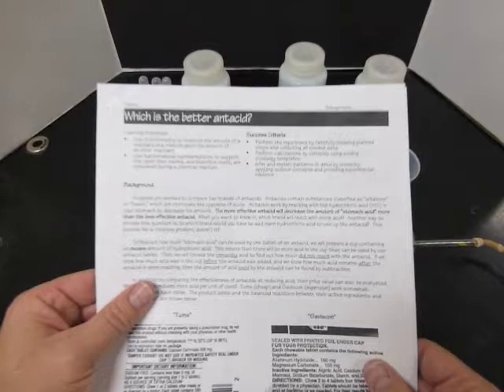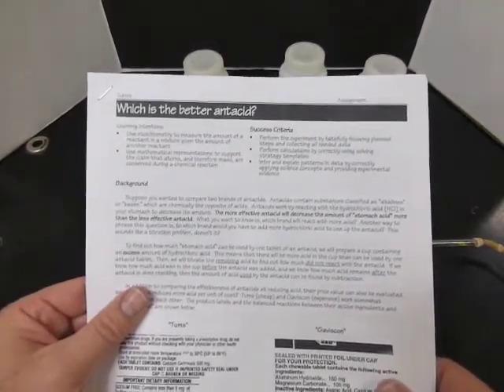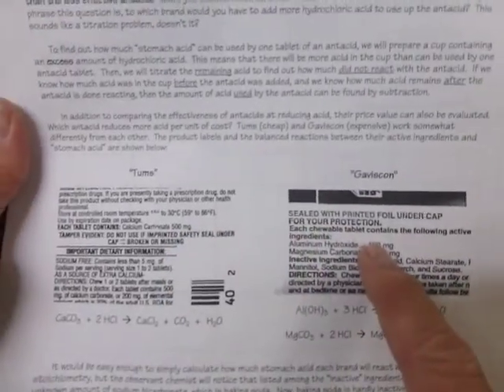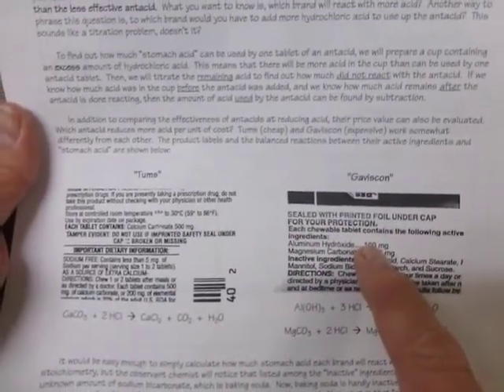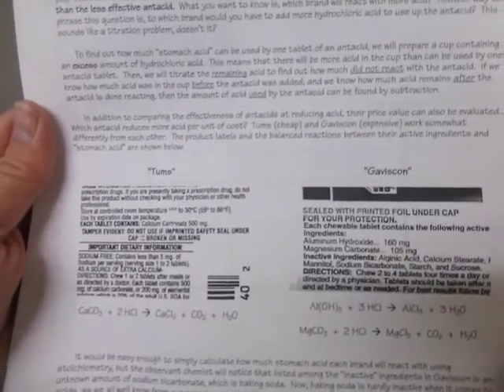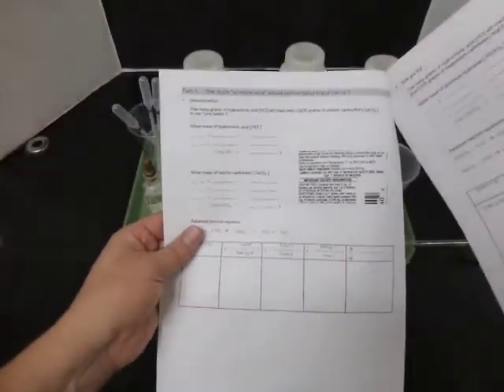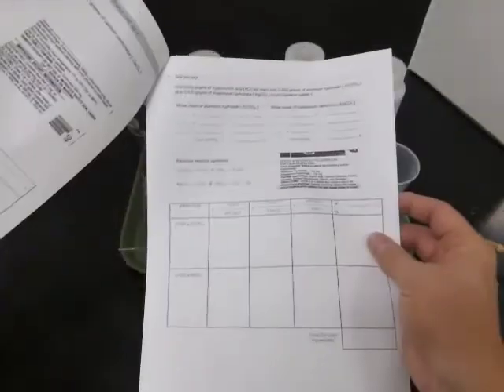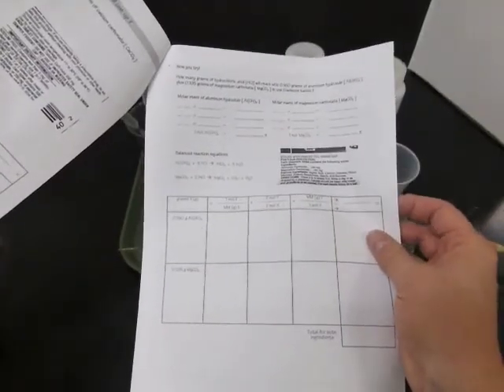Please make sure you have your copy of the assignment, which is the better antacid, in which we ask the question, which is better, Tums or Gaviscon? Both react with the hydrochloric acid in your stomach to reduce its amount, but they work slightly differently, with different active ingredients and different amounts. So yesterday we started by predicting how much acid Tums would use up in your stomach and how much acid Gaviscon would use up in your stomach.